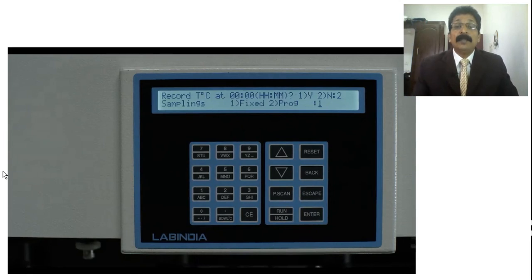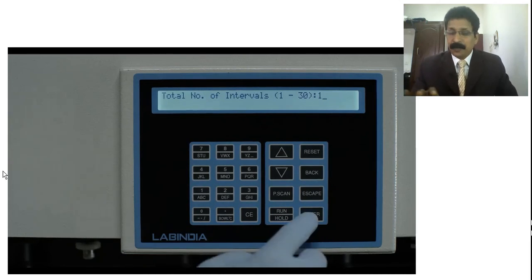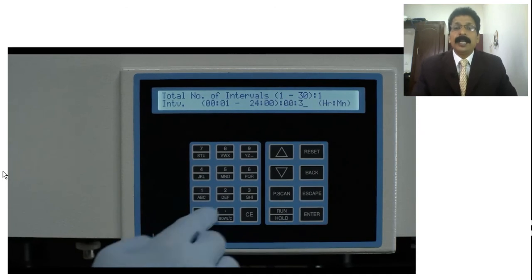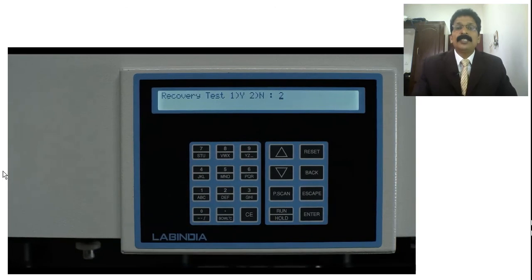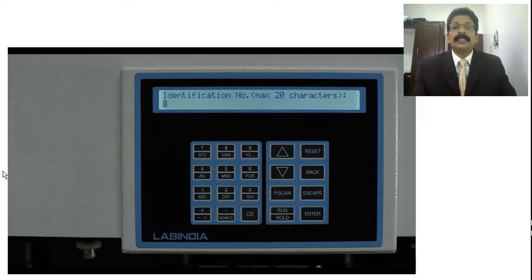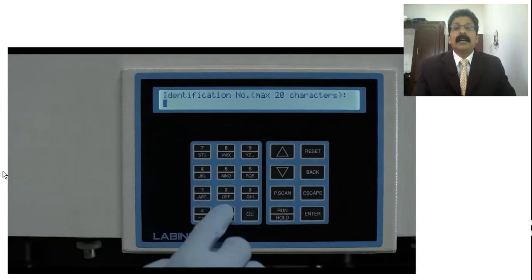The parameters, temperature, even temperature maintenance, and buffer solution formulas, everything you maintain will be given even in the record. It will give the printout, dates and the time, which also can be added. And once you start, it will say now it is a sample. Insert the sample, they used to say.